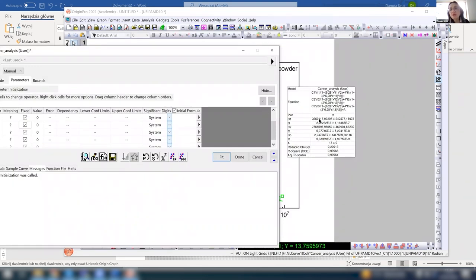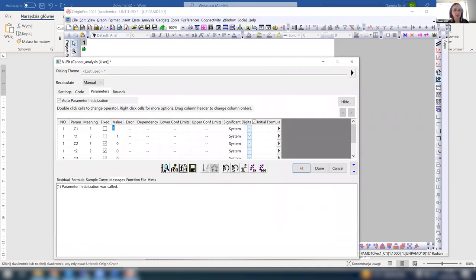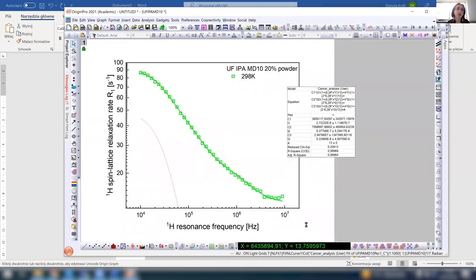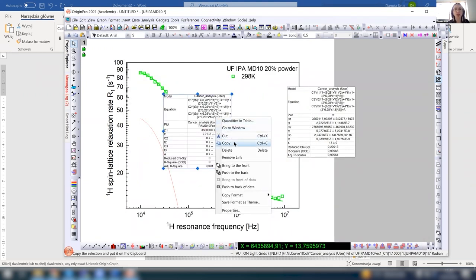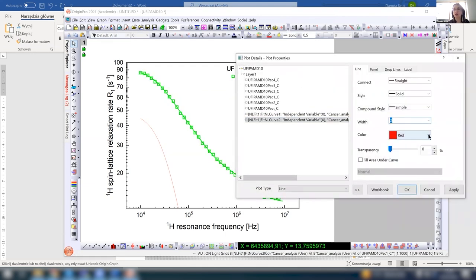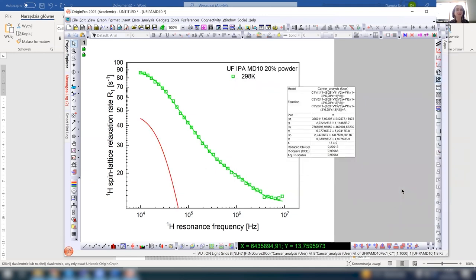You see this contribution is pretty small. 3.66, so this dipolar relaxation constant is pretty low, and 2.7 -6. Well, despite that, as the correlation time is quite long, this contribution is important. So you have here the slow contribution.